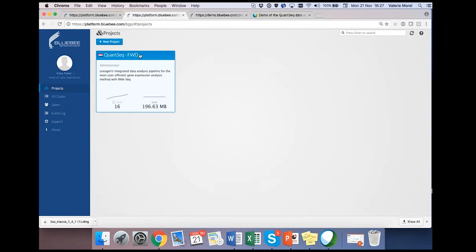May I change the parameters of the pipeline? Okay, so I continue. May I change the parameters of the pipelines, for example, the genome to align to or the annotation to be used with the HTSeq count? So far, we have preset genome annotations for the pipelines.